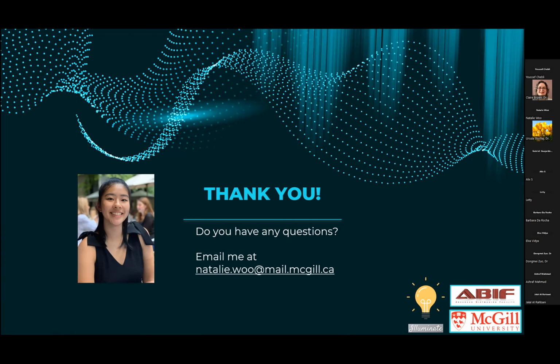Yeah. And I guess one more positive thing is, like I said, it clears the sample. So it also helps with the scattering. Because it's clear, you can go deeper because it's larger. Yeah. So yeah. Is that everything? Great.